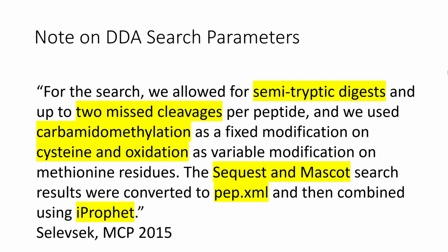Yeah. So basically, we've been working with fully tryptic peptides. A semi-tryptic means like, well, one of the ends has to be tryptic, and then the other can be anywhere it wants, right? And it turns out if you look at these search results, about 20% of the peptides in the search results are not fully tryptically cleaved. So that's right up there. We have a library that includes these semi-tryptic things, and we have to decide: do we want to allow them into our quantification? And since we're already struggling with memory here, we're not going to use them in our quantification.